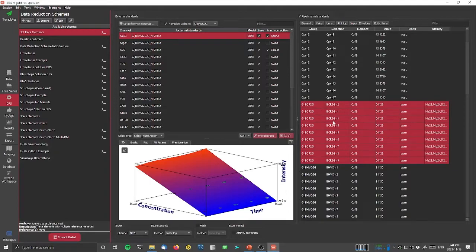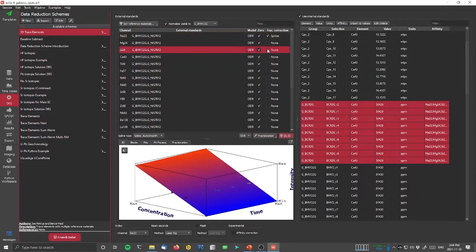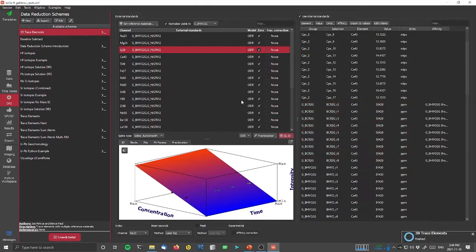are most like. So when I hit crunch, I'm just going to uncheck these checkboxes up here just for this little experiment, just so we can show the effect. So now when we click crunch, it will do the same thing as it's done in the past, except that this is a much faster experiment.